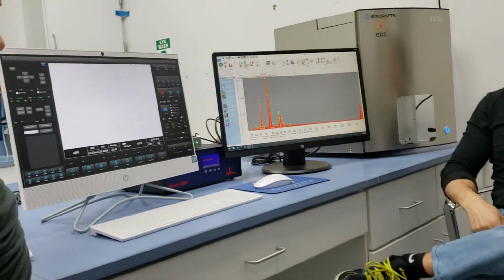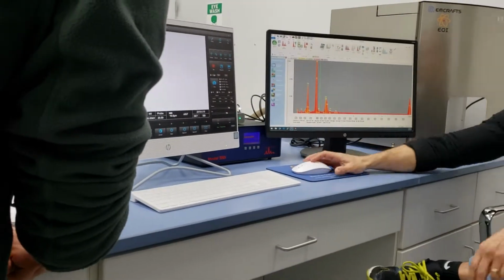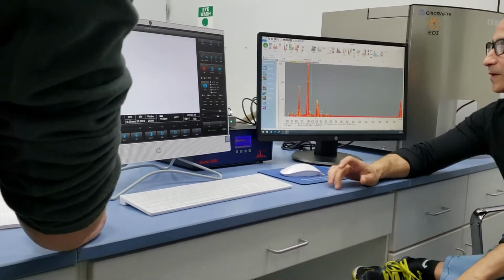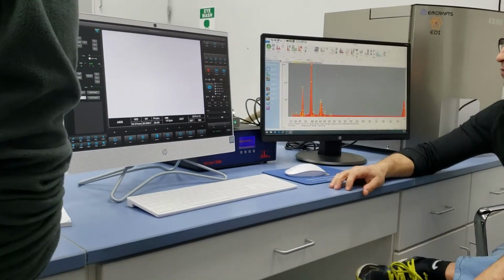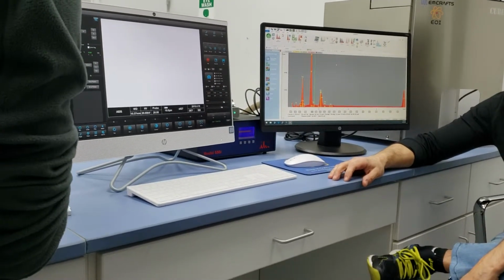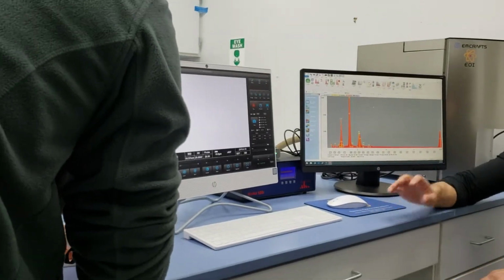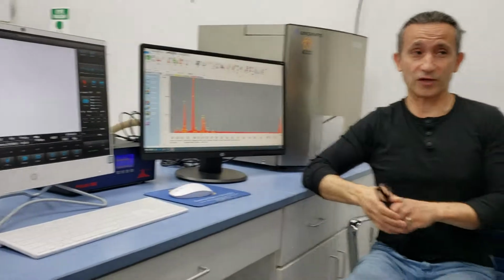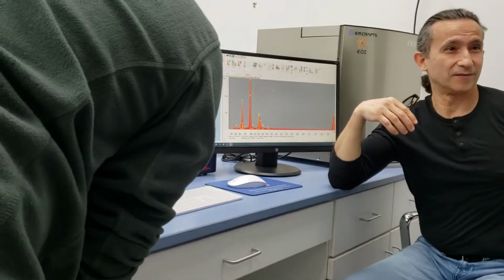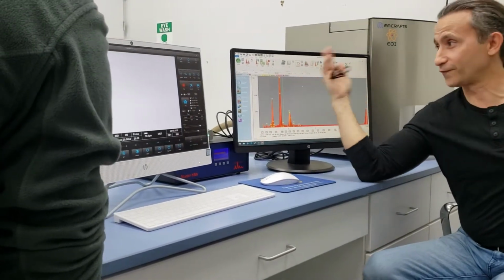So for X-ray maps, what settings of time constant 1 versus 4 would you recommend? I recommend time constant 1, and the maximum counts that you can get. Right now it seems to be around 40,000 counts, which is a lot, by the way. With a liquid nitrogen detector, just to let you know where you guys are at, liquid nitrogen detectors are anywhere from 1,200 to 2,500 counts maximum, no more than that. And the new SDD detectors allow you to pull 50,000 counts a second.